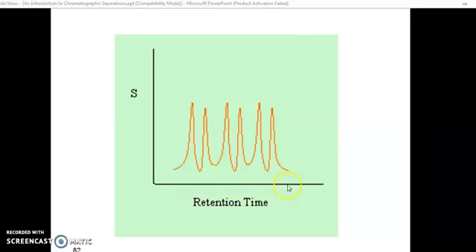So in this way you are confused about which one is the good one. I told you this first group is not accepted because it's less than 2. This one has less separation and is not defined exactly close to a resolution of 1 or 2. So this is not acceptable. The third one is also at the end of this, but the resolution is somewhat greater. So this composition we selected.